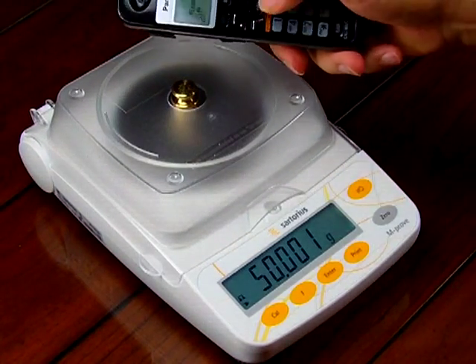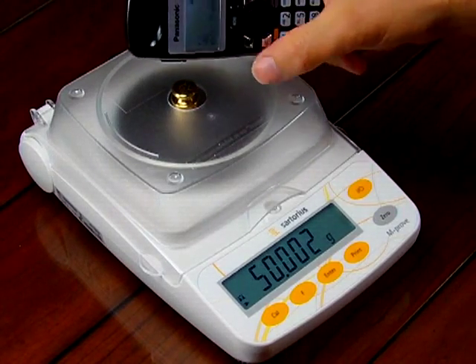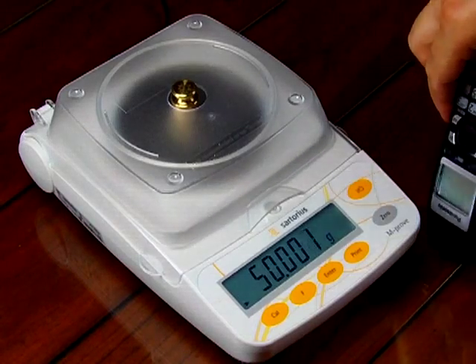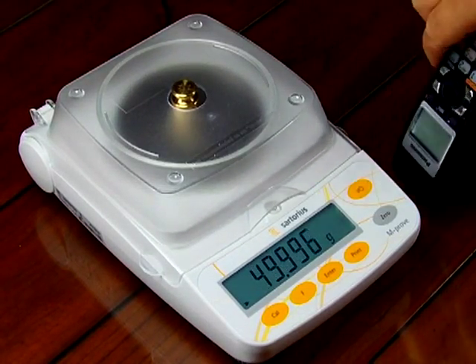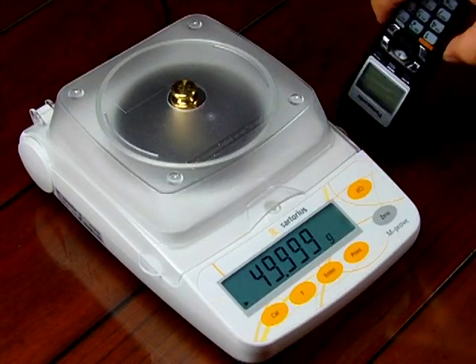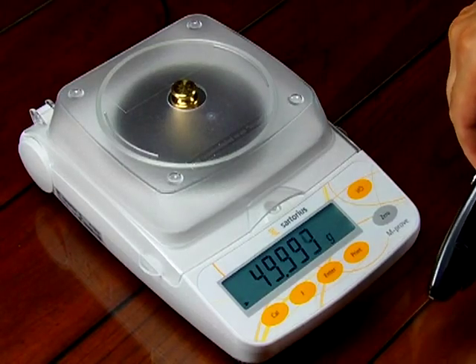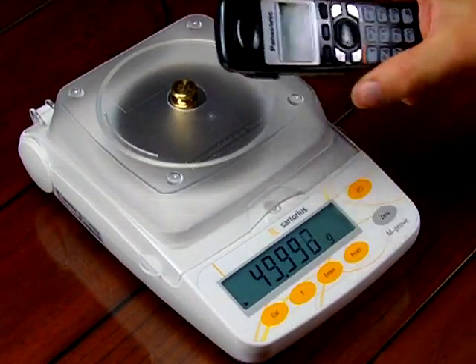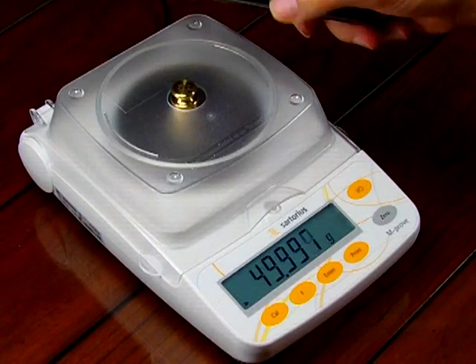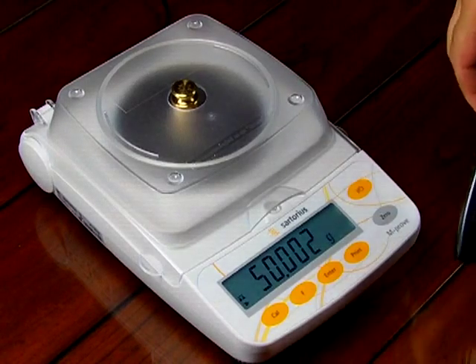One more time — I'm going to turn the phone on again with the talk button. When I press it on, look at the numbers go all over the place. This is substantial division-wise — you can see it's fluctuating probably 10 divisions. So again, I'll shut off the phone, and the balance reads normally.